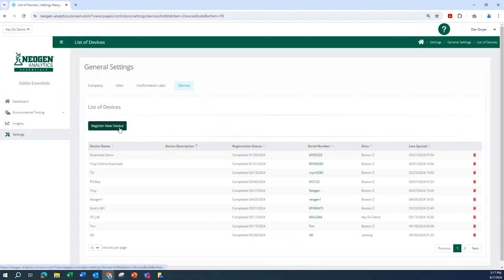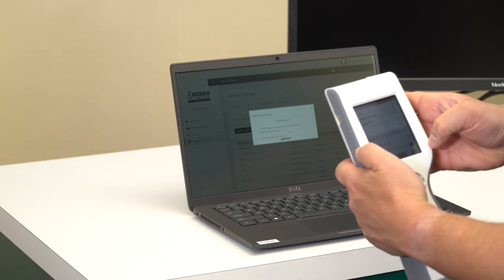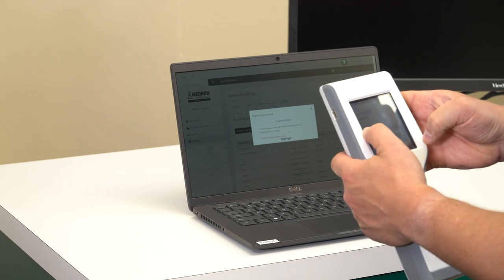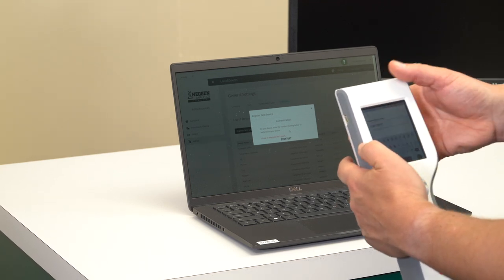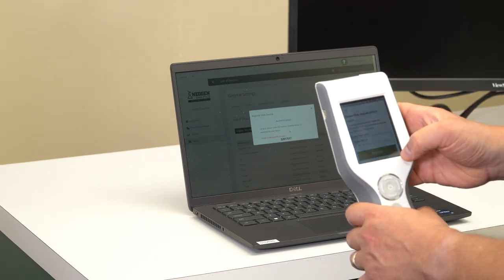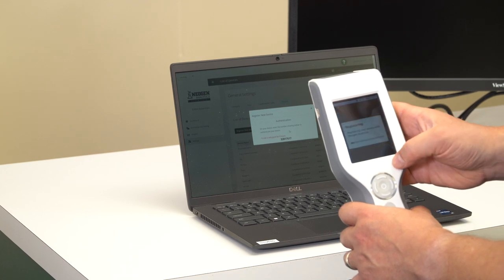Here you will enter the device type and the serial number of your device into Neogen Analytics. Once you submit, you will be provided with a registration code. Enter the authentication number that appears on screen in your device registration settings.